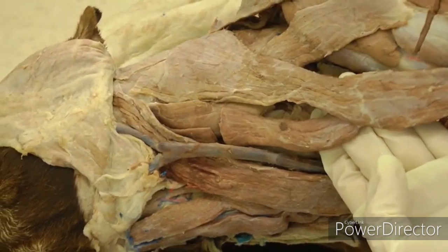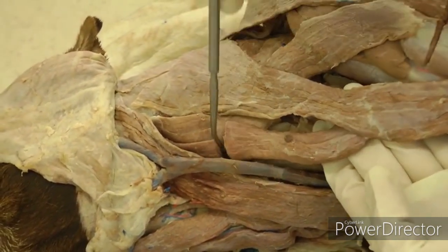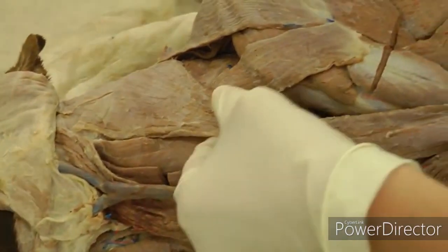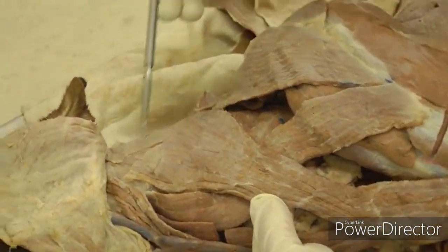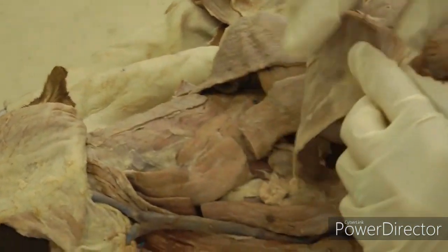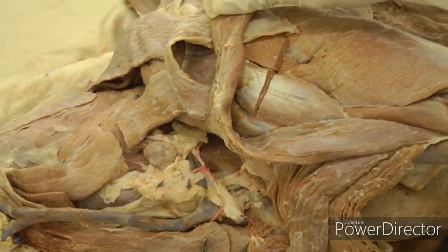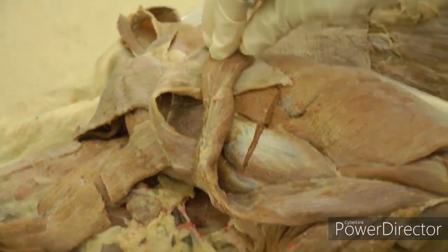Cut both of those — cut the pars mastoidea, leaving a little stump so you can identify it later, then cut the pars cervicalis up towards the neck, and reflect those pieces down. And that's it for lab one.